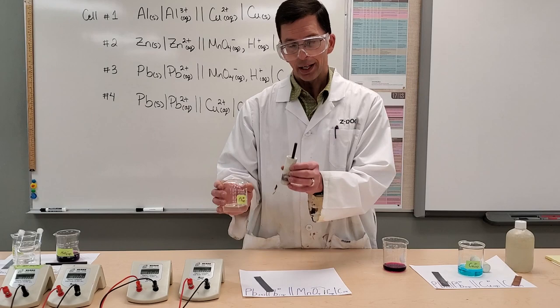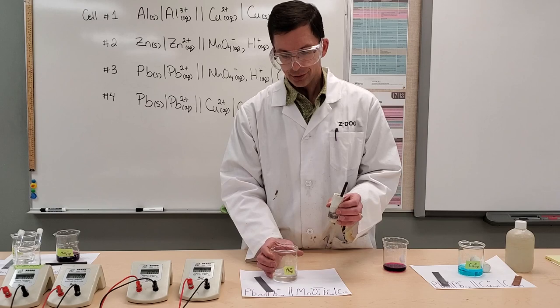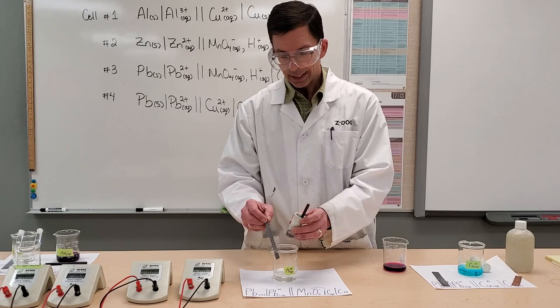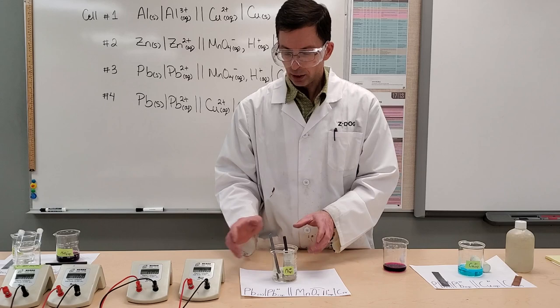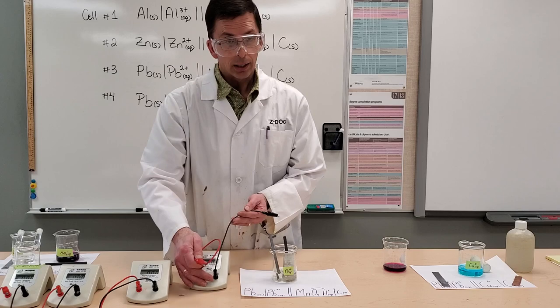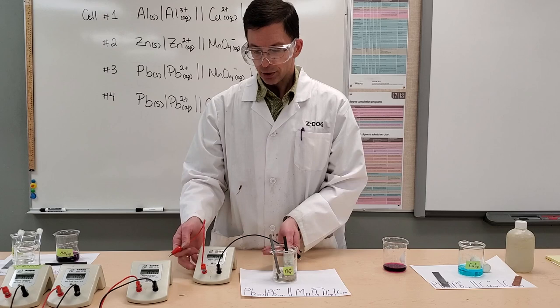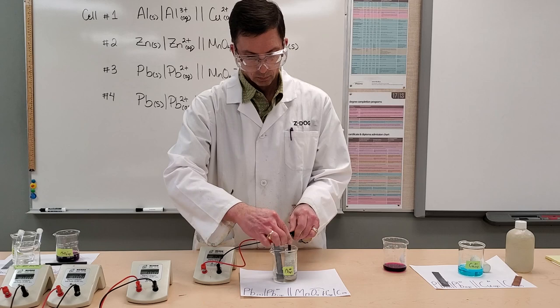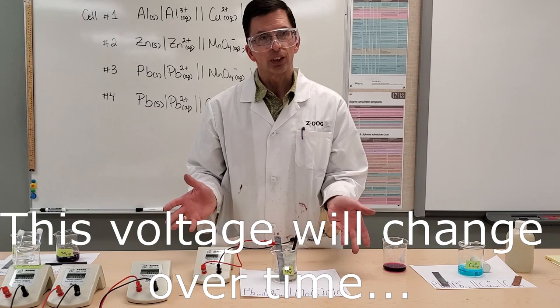That all goes into my other half cell, which is existing inside this beaker, which are lead ions and a lead electrode. And again, the oxide layer has been sanded off this reducing agent, so we don't inhibit electron flow. And then simply we connect our voltmeter. Our electrons flow from our anode to our cathode, A to C, and we're going to register net voltage. Positive 1.25 volts, folks.